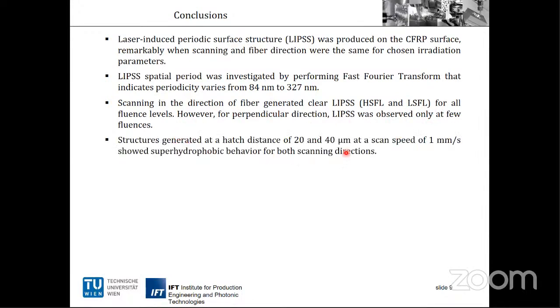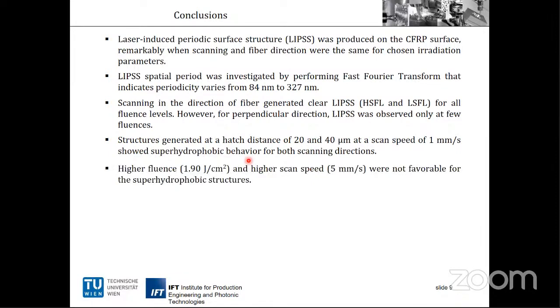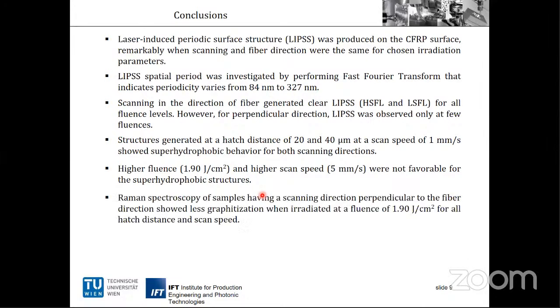So these are the two parameters where we have seen super hydrophobic behavior for both scanning directions. However, higher fluence and higher scanning speed are not favorable for achieving super hydrophobicity. Raman spectroscopy analysis shows that in the scanning direction perpendicular to the fiber, less graphitization happened at the higher fluence for almost all scan speeds and hatch distances.